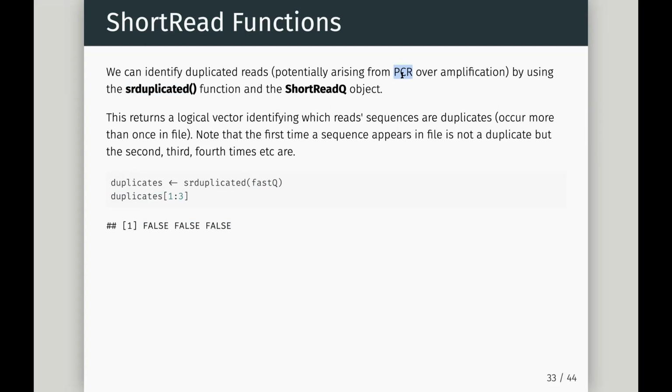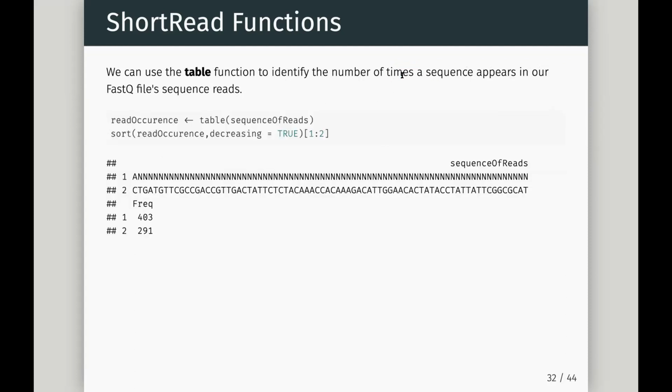If you're doing ChIP-seq, it's also quite unlikely, so we like to remove duplicates from ChIP-seq. RNA-seq, there's things like actin beta. It's so well expressed, and it's actually quite short, that you do expect to see duplicates there. So removing duplicates is really dependent on the sequencing you're doing, but having a measure of your duplicates is also very important.